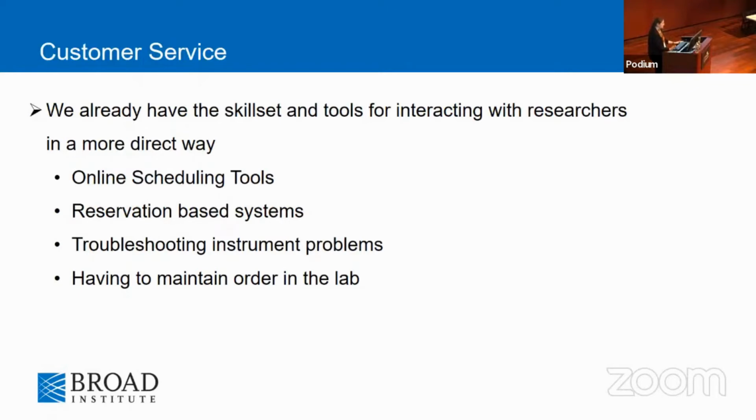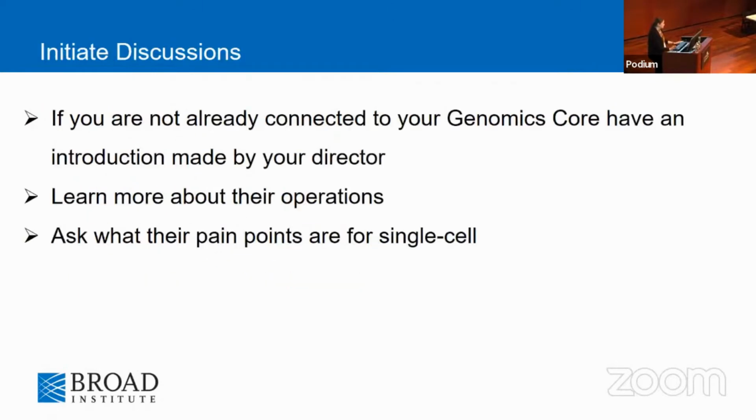And I think that's really appreciated when people come to learn how to do this for the first time, because it isn't very straightforward. It's not an easy approach to do. And so really helping people troubleshoot those problems, and using those same skills that we have on the flow side, online scheduling tools, maintaining a lab, making sure it's nice and neat, those just go a long way.